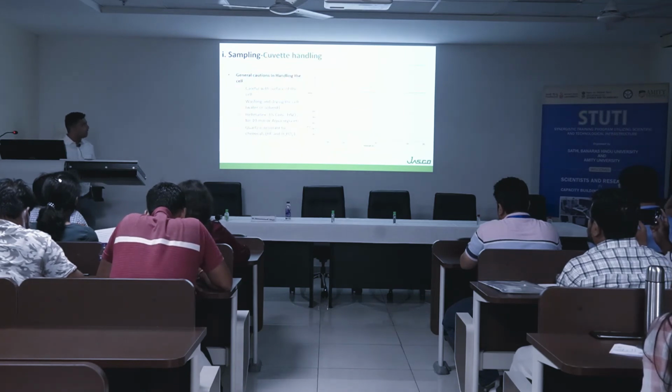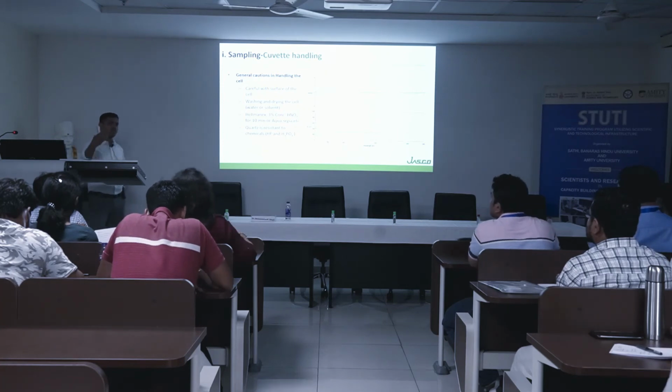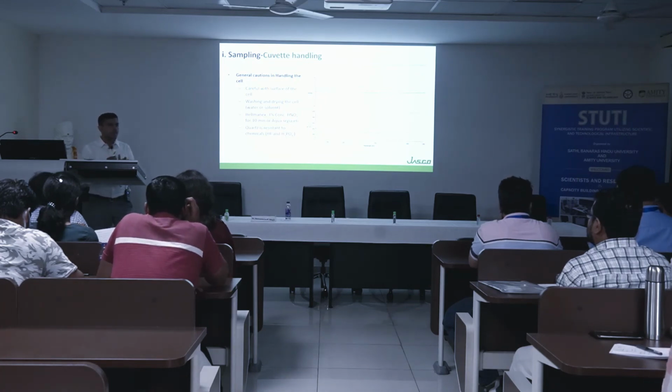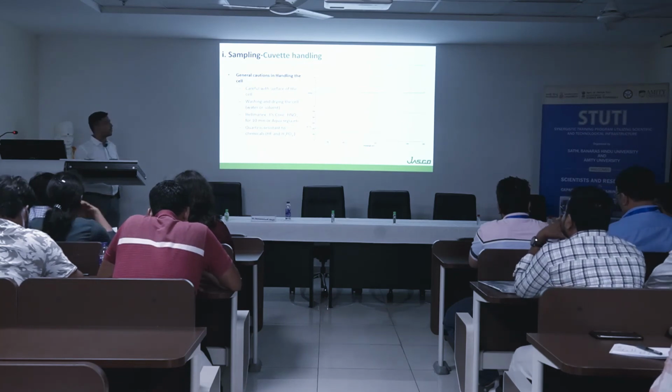Okay. So like I said before, when we work with the cuvette, each and every component is very important. Even in the cuvette, when you work on secondary structure estimation, or on the thermodynamics of your protein, like how stable your protein is, which we figure out based on the melting temperature. If you want to work on the thermal stability of your proteins, or on kinetics, each and every time we use this cuvette. So cleaning of this cuvette is also very important.